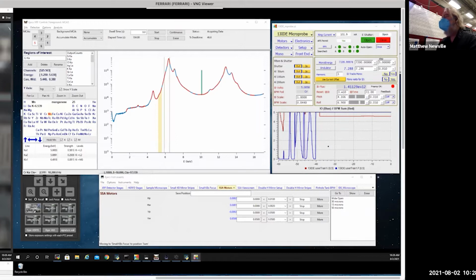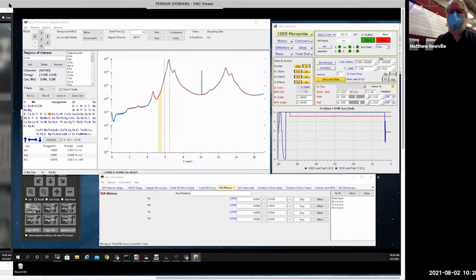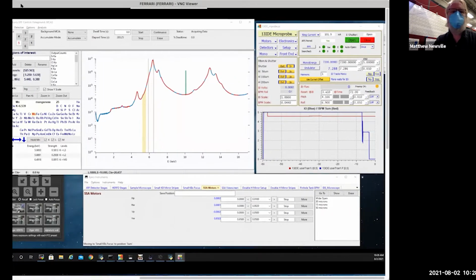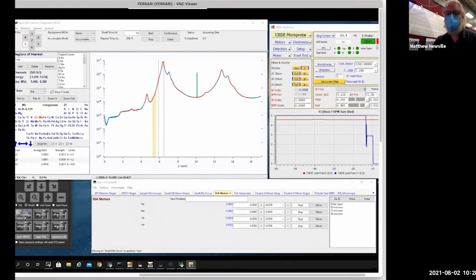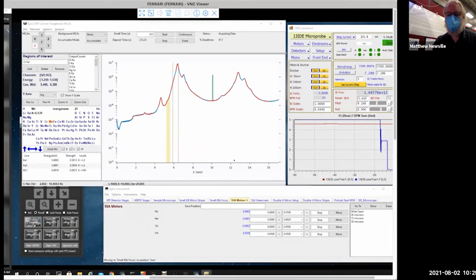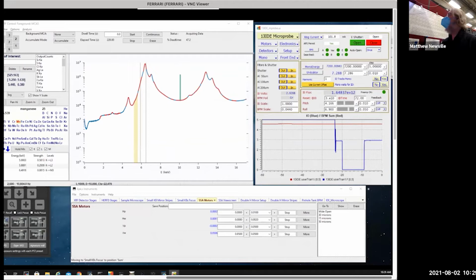I'm also going to set up the ion chamber gains. I will talk about that in a little bit, but first I'm going to get it set. And then I'm going to show you what that little red button in the upper right shows. It shows me that I want to fix that. Right. So then it's going to do some offset collection. So we have now, this is reporting the flux of about 1 × 10^12 photons per second in our spot size of a few microns at 7.2 keV.